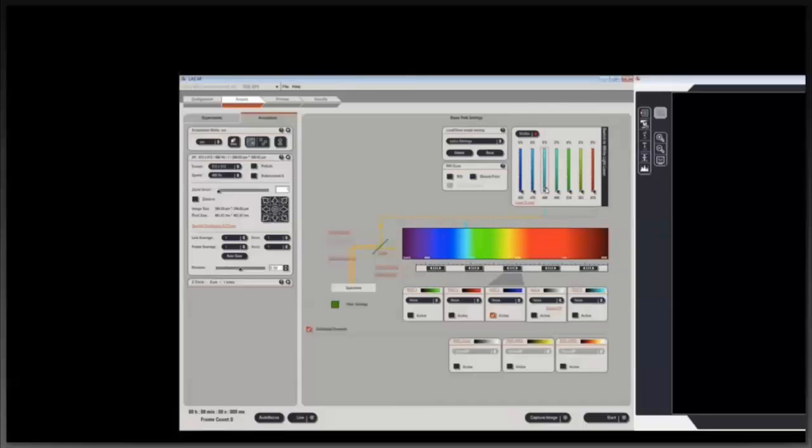So if I turn this on, put it on about 10%, then what's nice is that we can actually see the light path. So we can see the light coming, hitting a mirror, and it's being shone onto the specimen. This has gone through the scan head onto the specimen. Emitted light is then going to come back through towards our detectors. So we have our laser line up here.